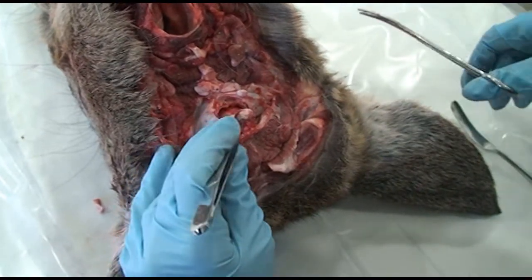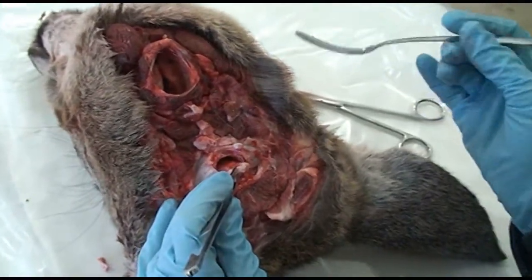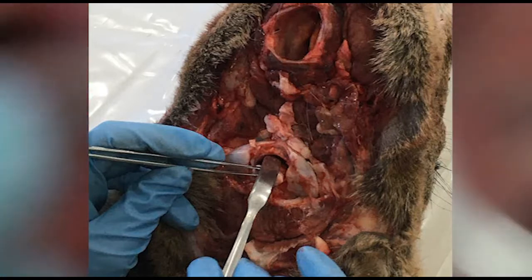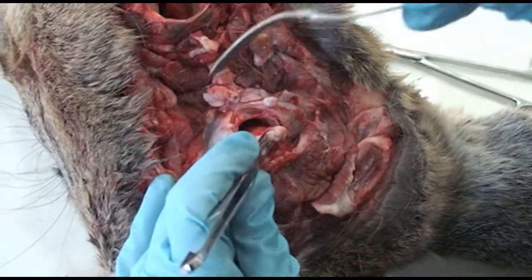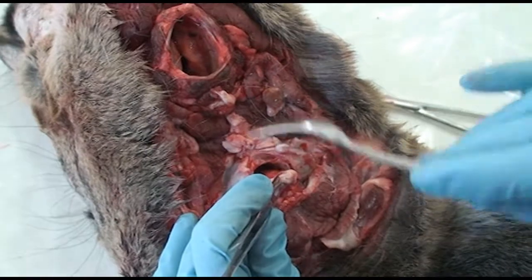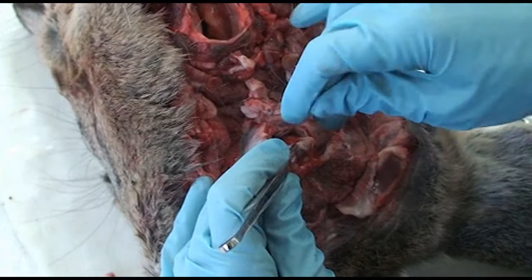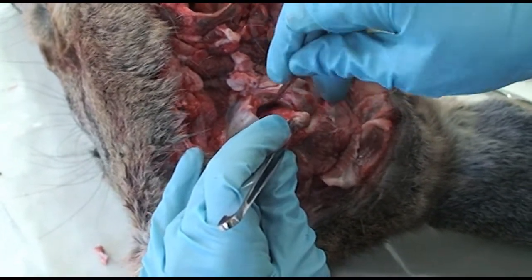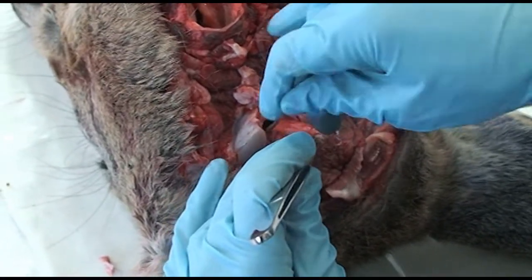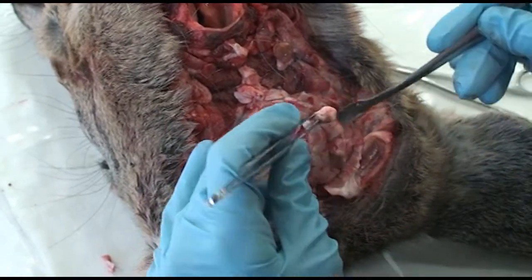And once you feel like it's pretty loose and you believe you have it, then you're going to want to use your sampling spoon. When you go in with your sampling spoon, you go in on top and you hold it up and you go down. And what you're doing then with the top of it is you're severing the spinal cord down past what you want to pull out. So you go in, you go down, and then it's just a side-to-side motion. And you can gently tug the spinal cord while you're pulling it out, and it should come pretty easily.